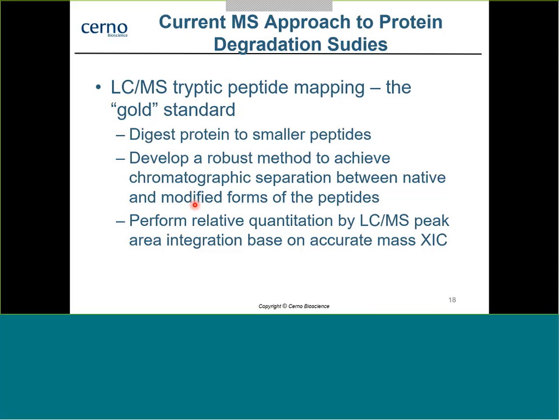And we're going to take a look at this. And we're going to see some of the pitfalls in this particular method.